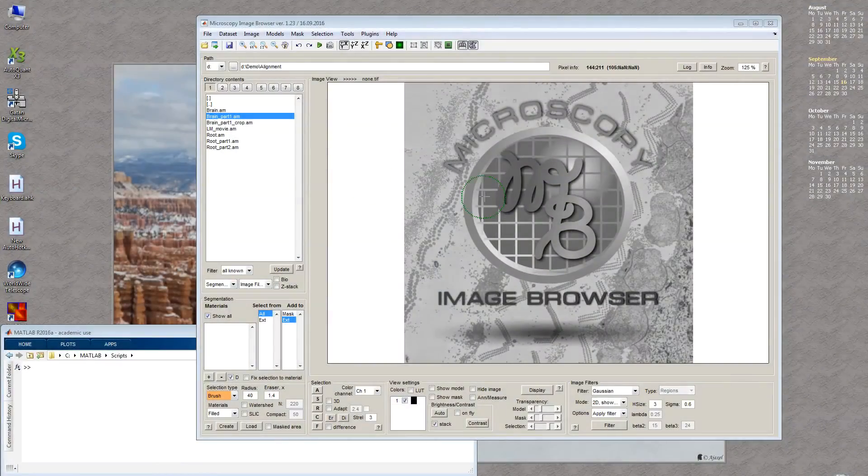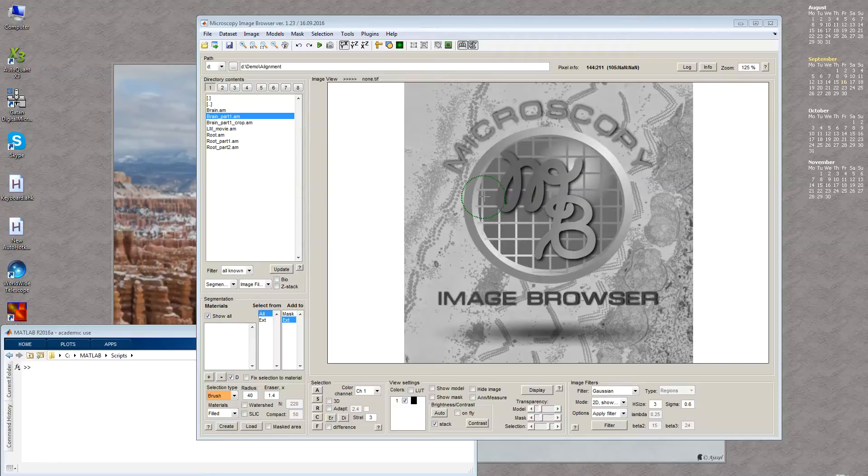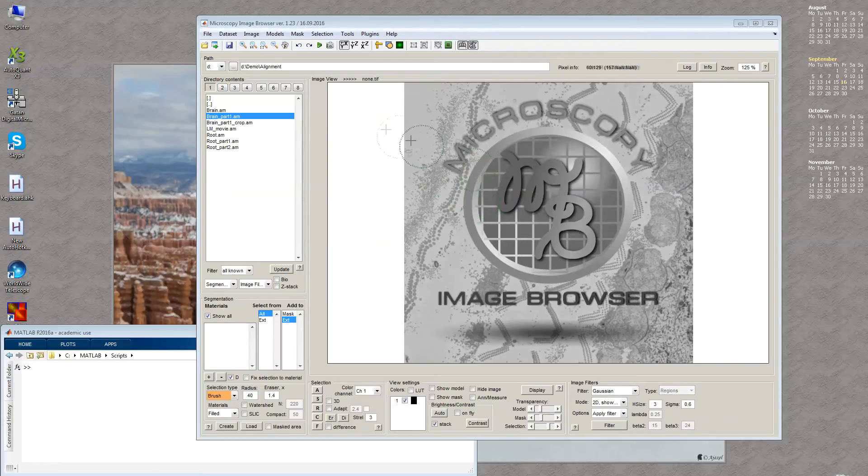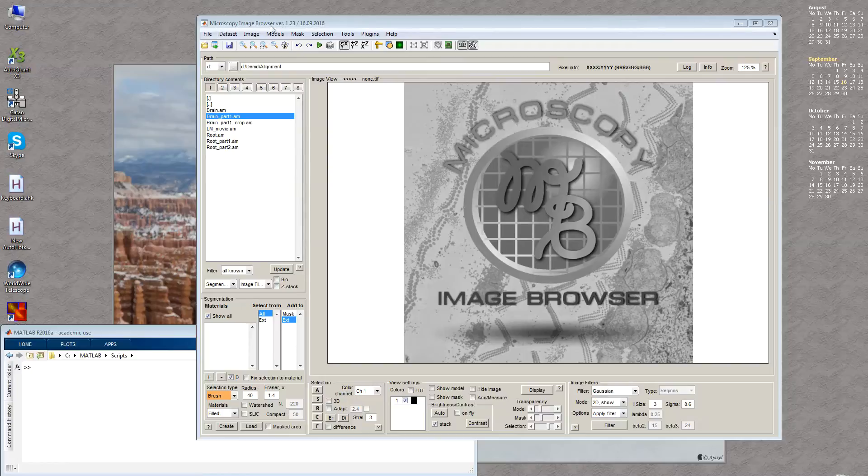Hello everybody, in this video I would like to show you the updated version of the alignment tool which is available from microscope image browser version 1.23.